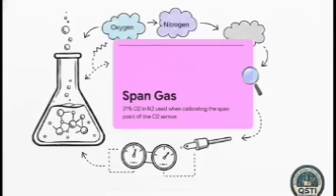Then, for your high concentration point, what we call the span point, you're going to need a very specific span gas mixture, specifically 21% oxygen in nitrogen. This mixture is a real game changer because it gives the sensor the exact high-end reference it needs to accurately calculate the full spectrum of your measurements. It's giving the machine its absolute upper limit.